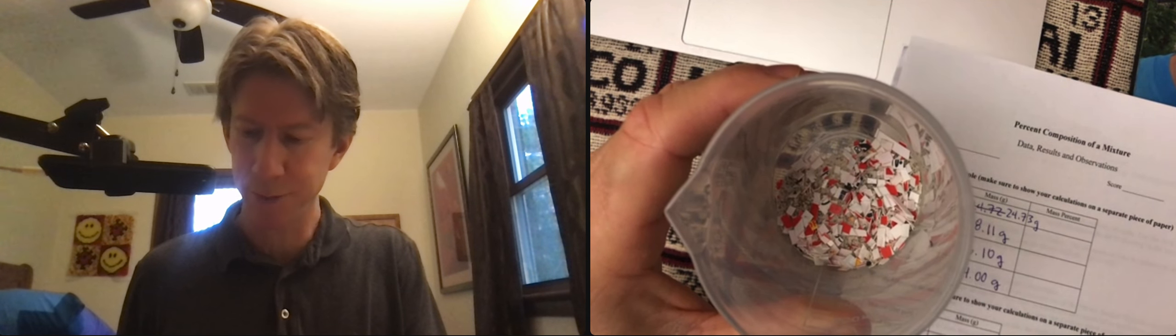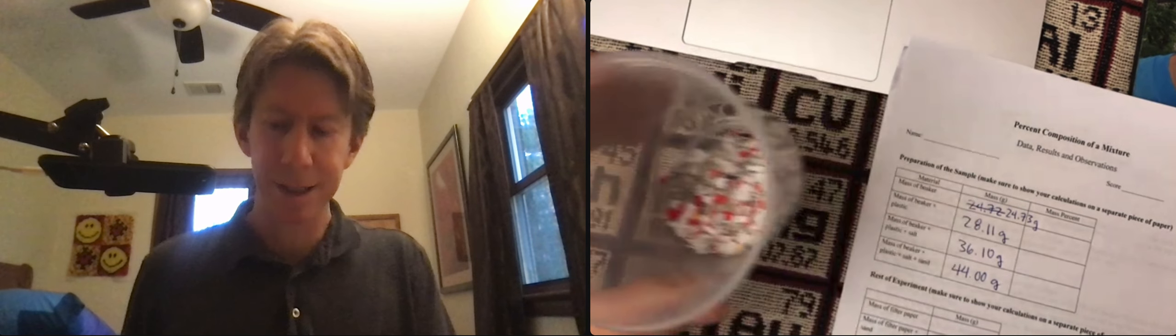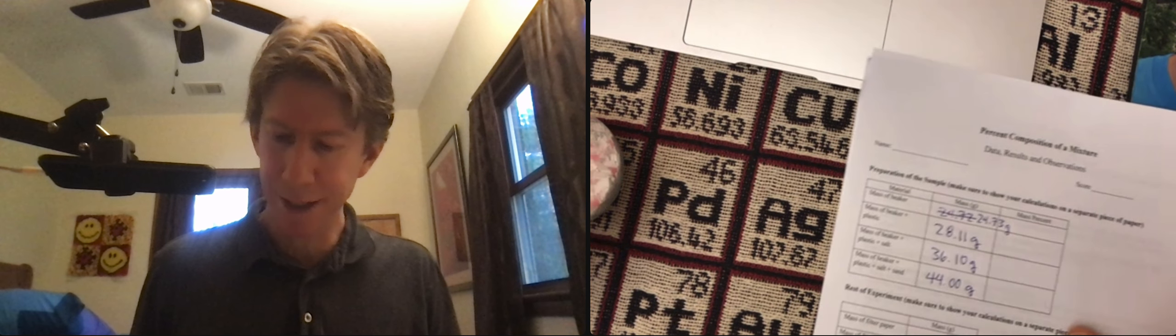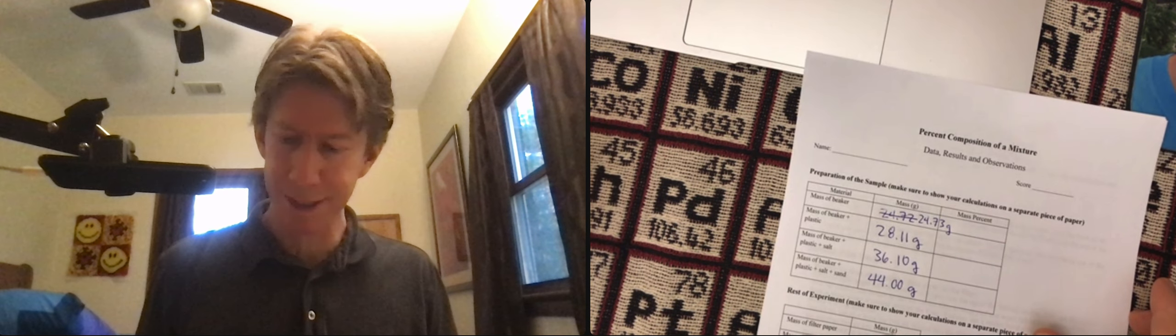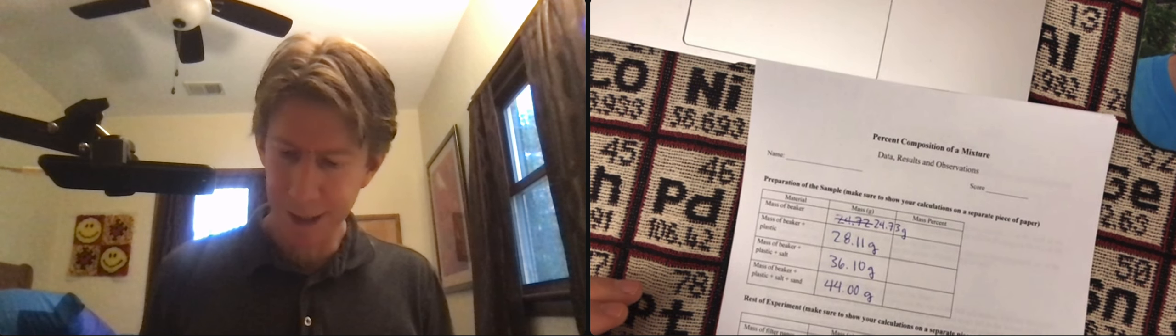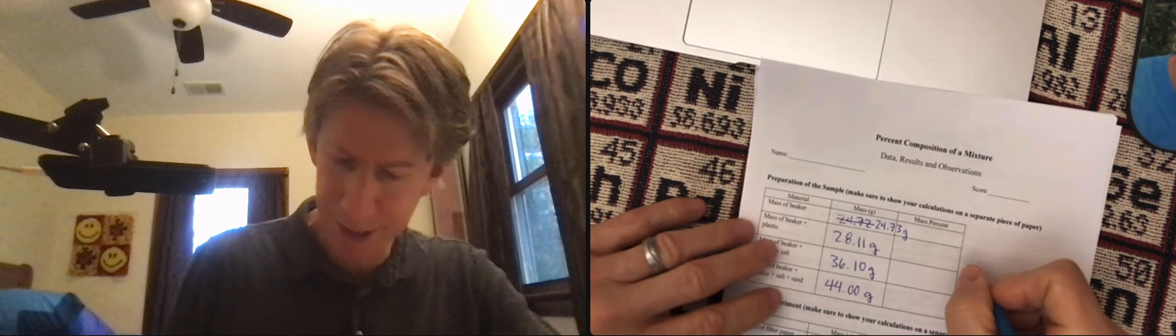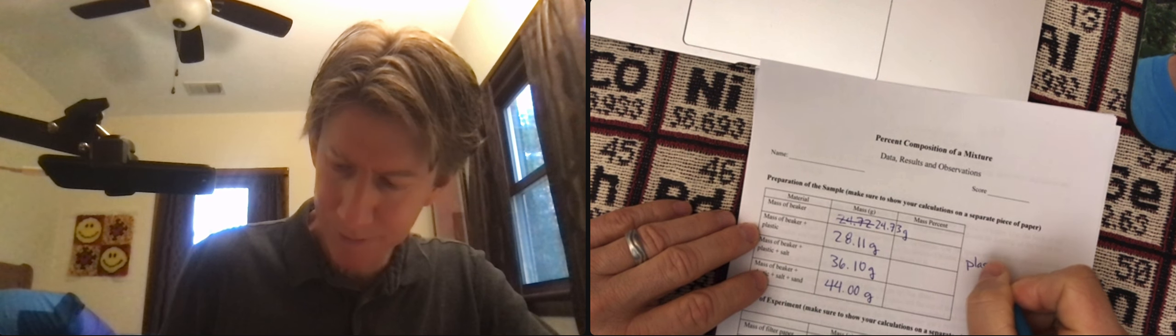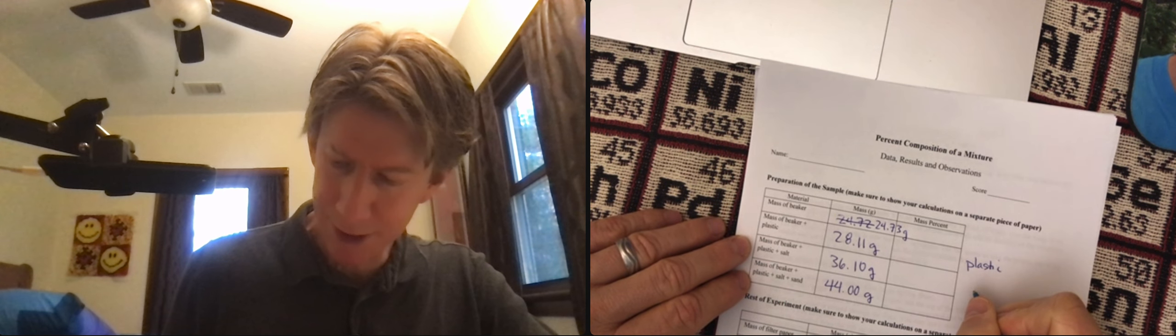And then you're going to snap a picture of that as your first picture. And let's go ahead and do the mass percents. This is going to be the mass percent of plastic, mass percent of salt, and mass percent of sand.